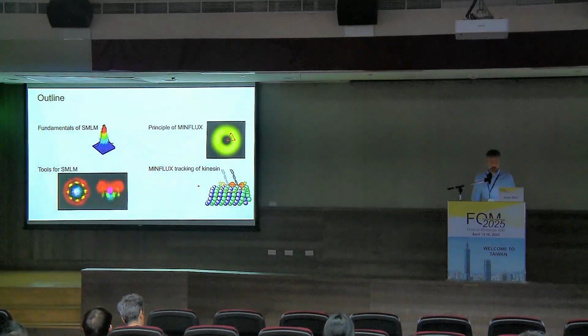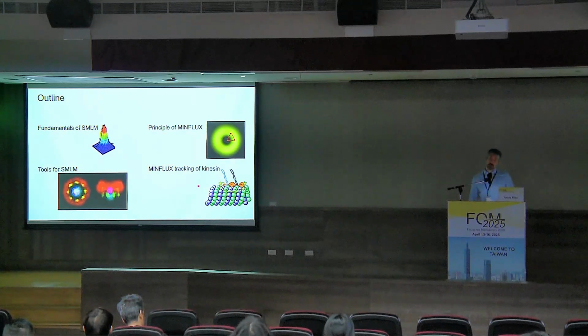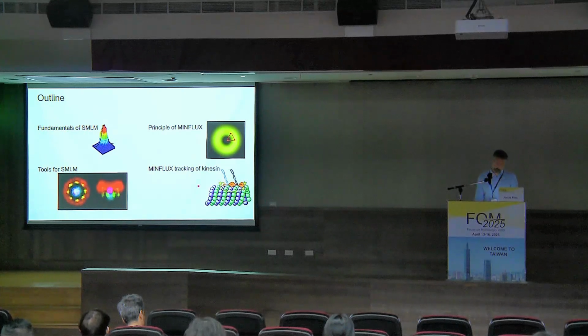So that brings me to the outline for today. I will, during the first half, talk about single molecule localization microscopy, and during the second half about MINFLUX. And I will start by explaining some fundamentals and then give some examples, mostly of tools that we developed in the lab.